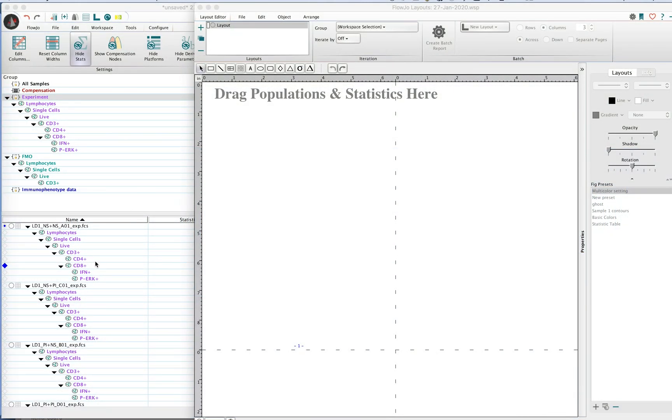Welcome to this video tutorial on how to align your plots in the layout editor. You may have a bunch of populations in the workspace that you would like to create reports for.